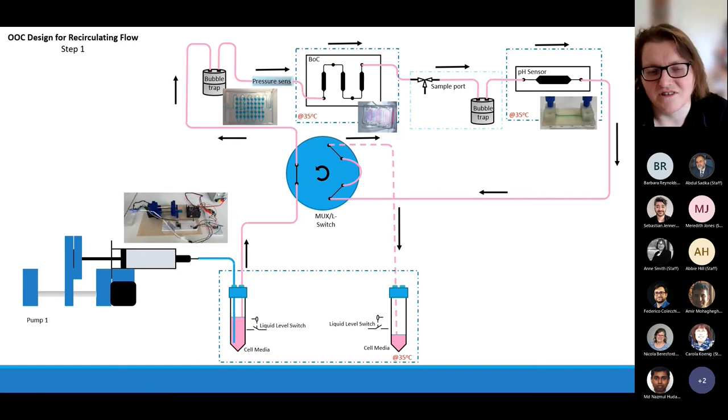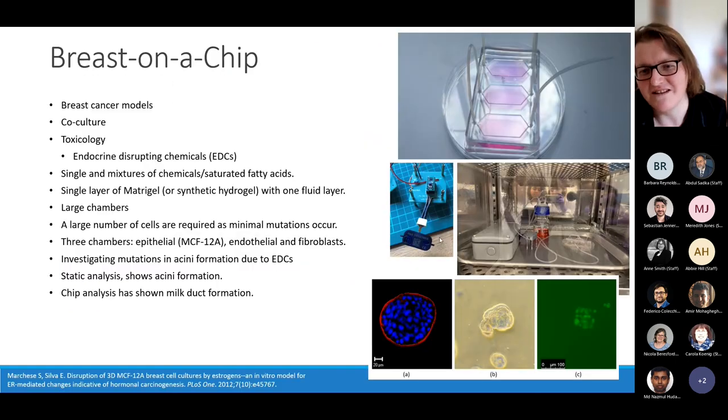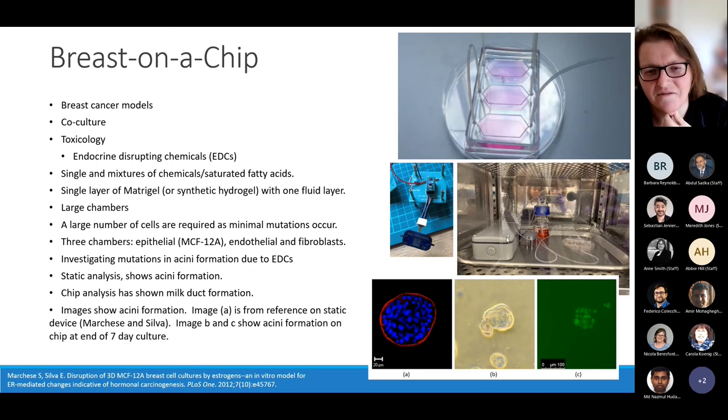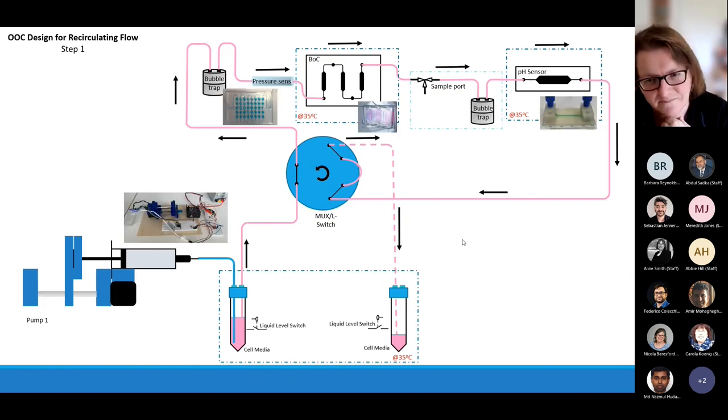At the moment, the electronics is in a bit of a tangle, as you can see, but we have different systems. So I have a couple of systems. I have one that's nice and neat using peristaltic pumps, and then I've got another which is kind of in development, with everything completely integrated with all the sensors.